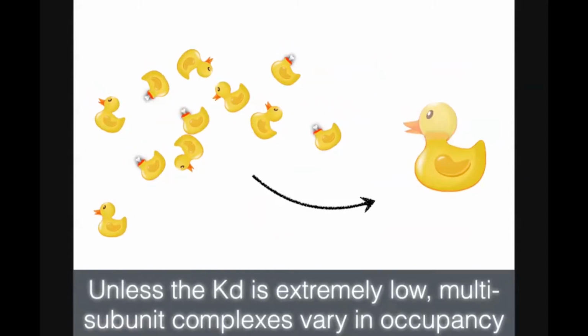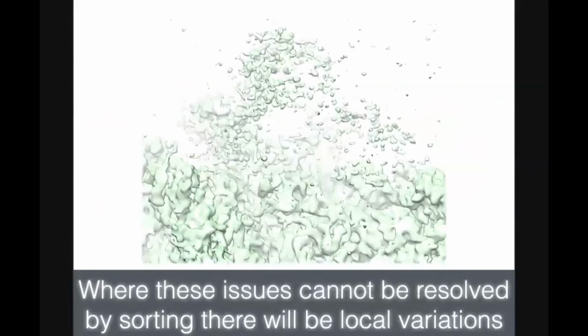We also have problems with variable occupancy, as you can see here. Some of these have heads, some of them don't. And this can sometimes be sorted away, but sometimes it can't, and this is dependent on the sample. The end result of all of this is that we end up stuck with noise that we're trying to exclude from our reconstruction. It's coming in from these particles' noisy background. And once again, the results can be effectively impossible to interpret. You can see that this is all popcorn up here, and this is a factor that's bound to a ribosome.